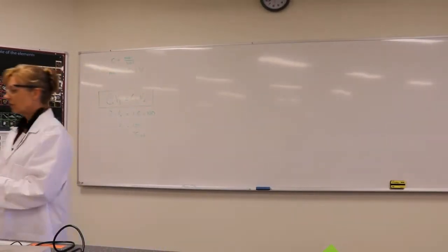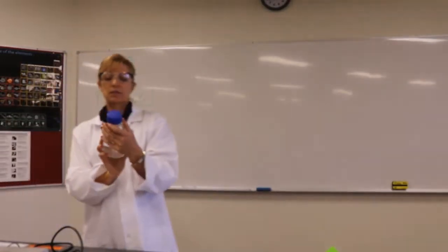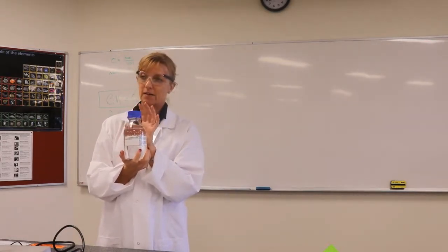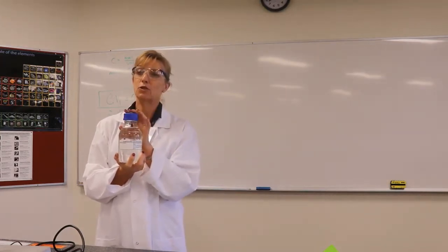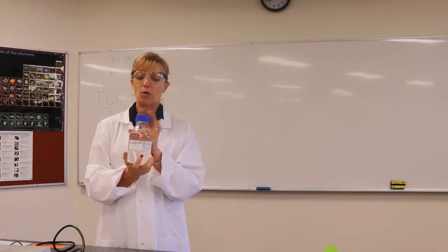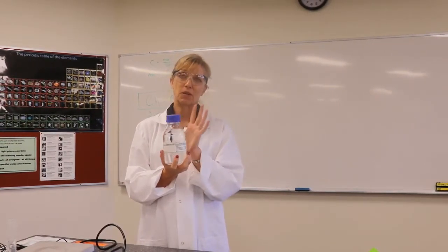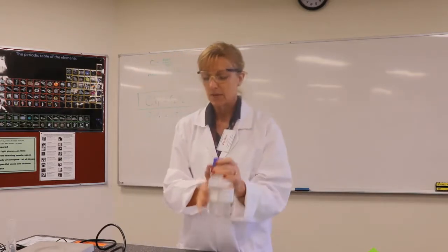You're dealing with hydrochloric acids of different strength. This one happens to be 1 molar, but 2 molar as well. Hydrochloric acid at these strengths is not that dangerous, but you do not want to get it on your skin. So you've got to be careful, and if you do get it on skin, you want to wash it off. If you were to spill it, you neutralise it with the opposite to an acid, which is a base, and the base that you'd have at home is sodium bicarbonate, which is an ingredient of cakes. So watch the acid, be careful.